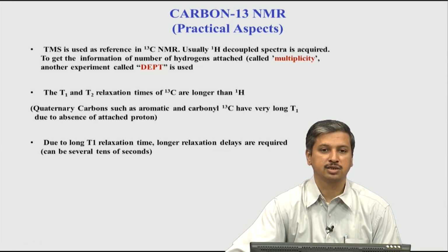So, that increases the time a lot, because if one scan is going to take about a minute, so if you want to do a 100 scan experiment, it will be 100 minutes. So, you see the problem is, because of a longer delay, our time is also increasing a lot.